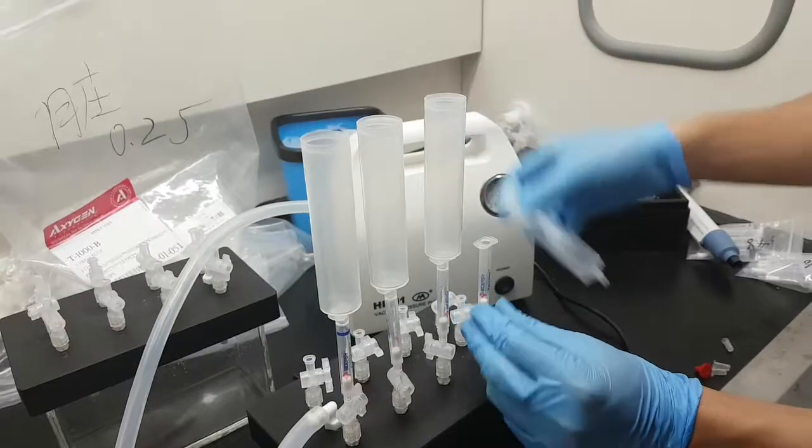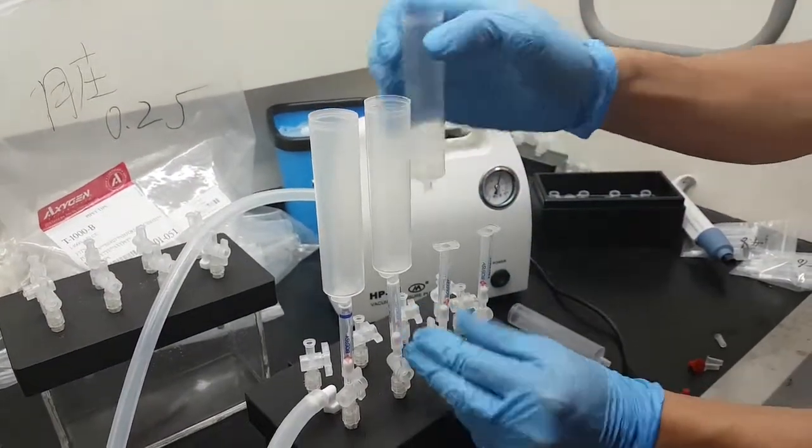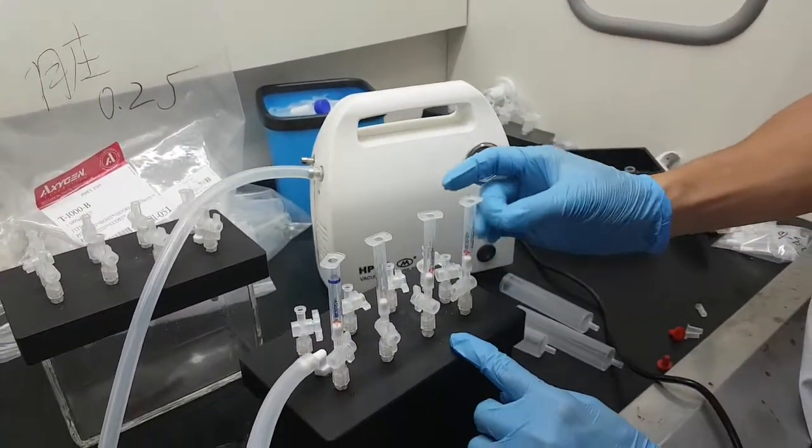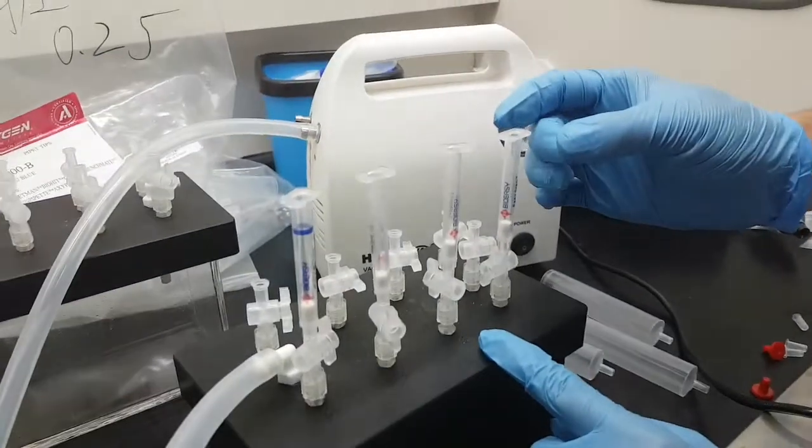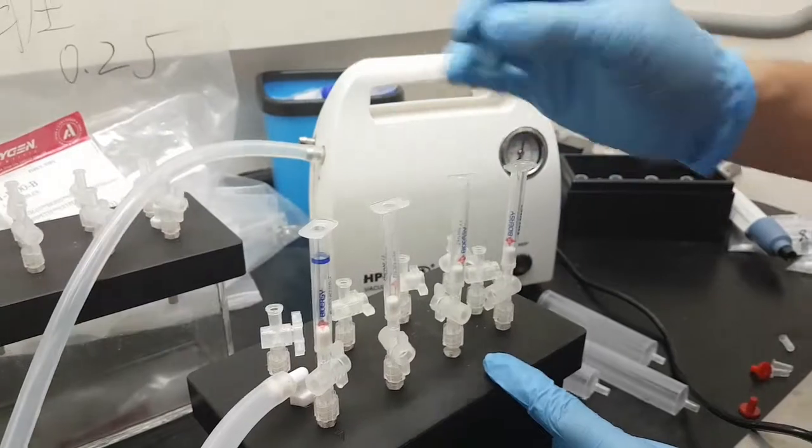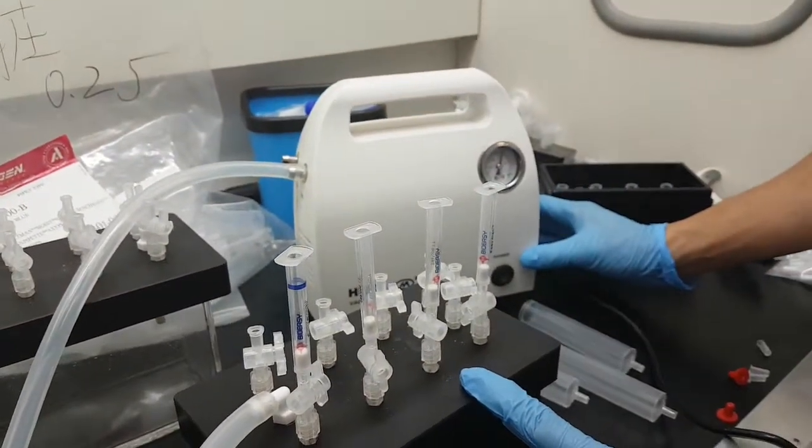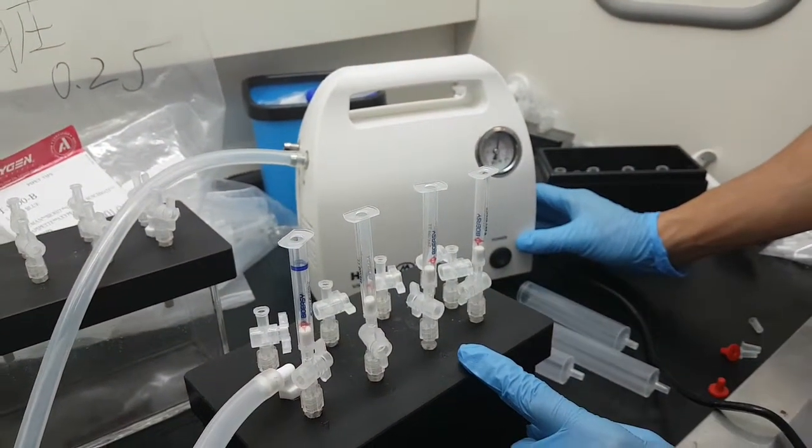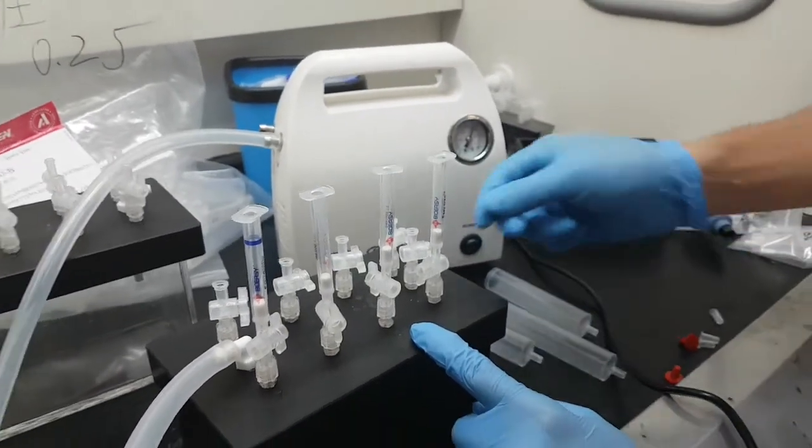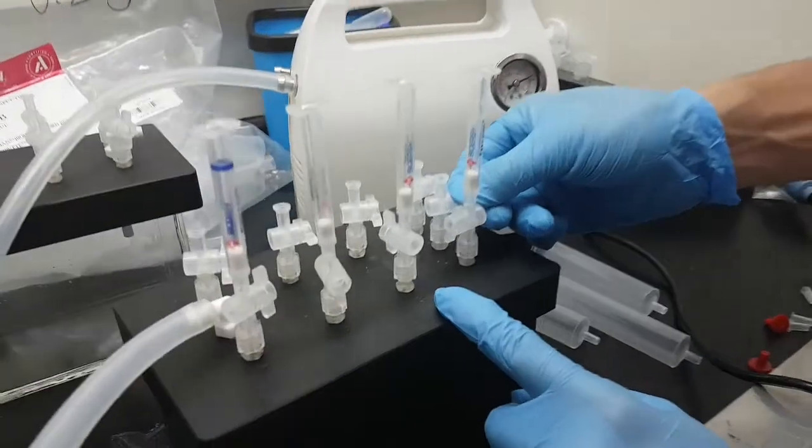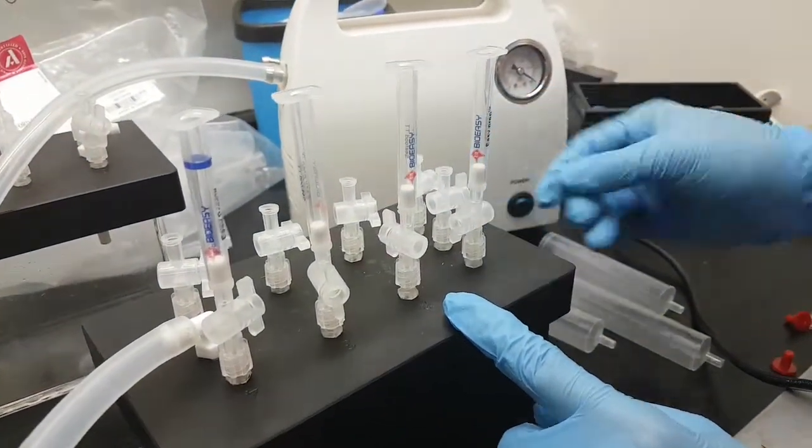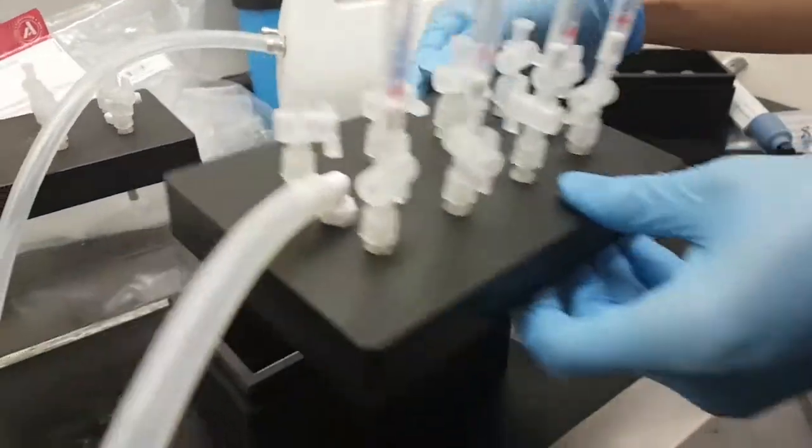All the liquid should flow through the extraction column. Take out the syringe and use the finger to pinch a bit. So it will take about 10 seconds from the moment we take out the syringe. Now we turn off the vacuum pump, release the pressure, and open the cover.